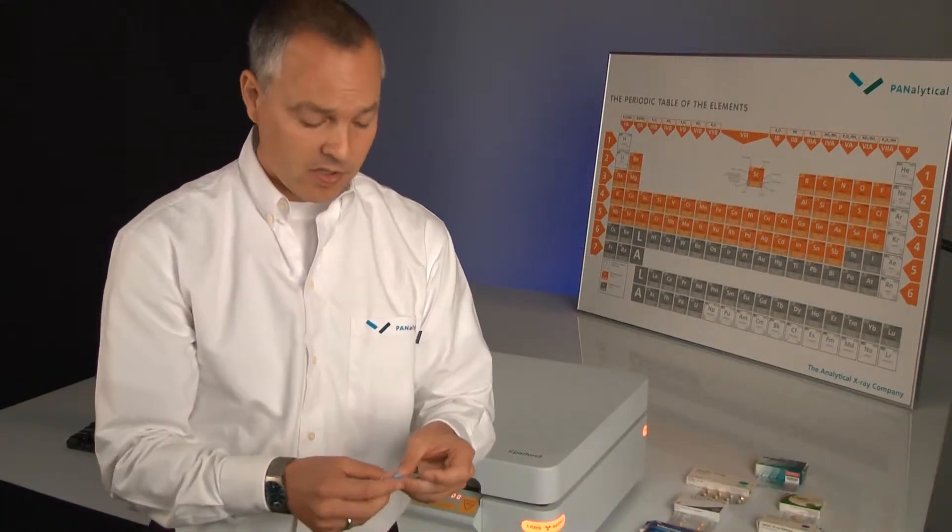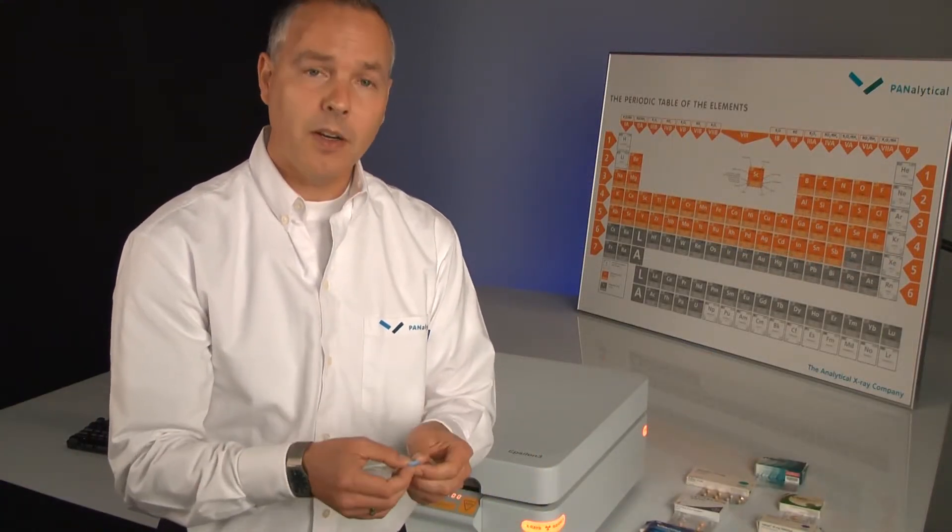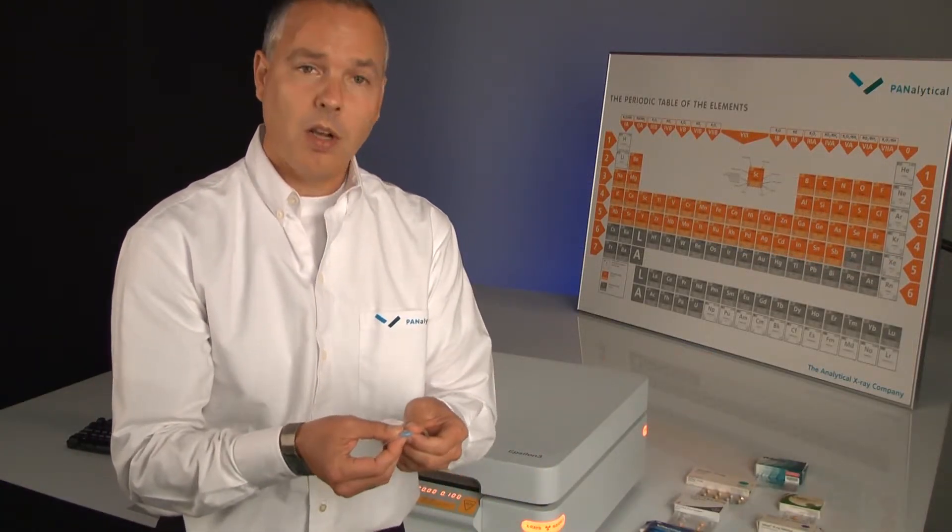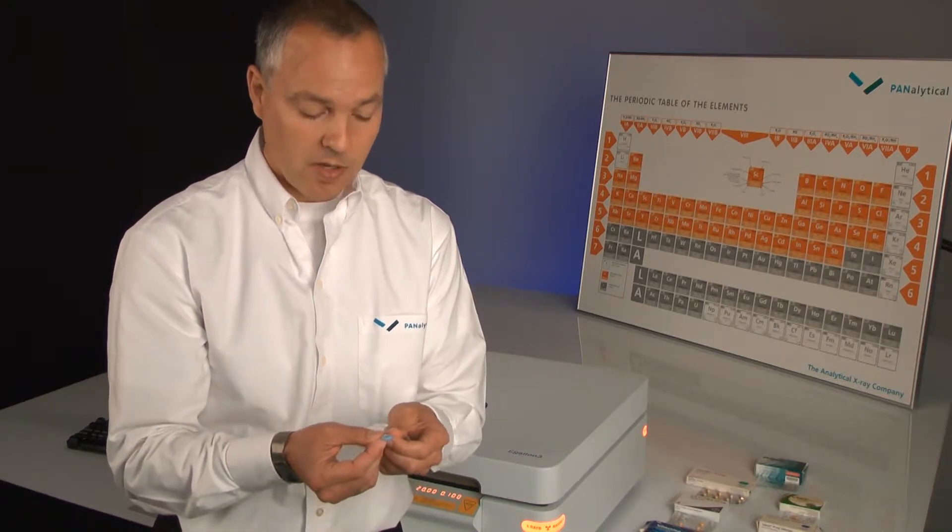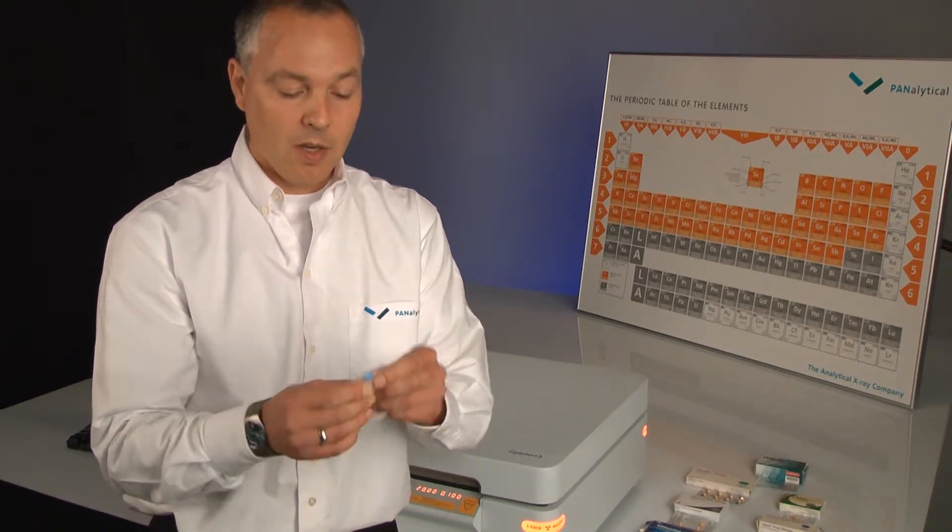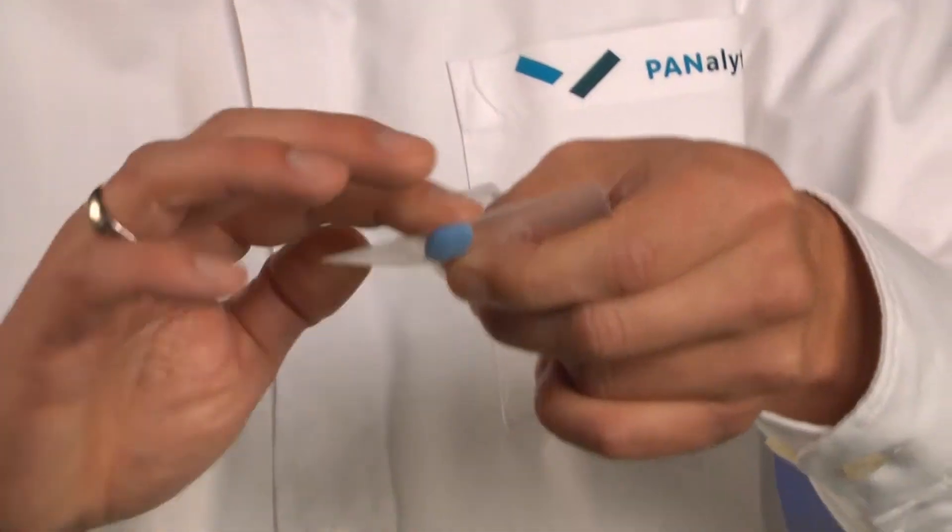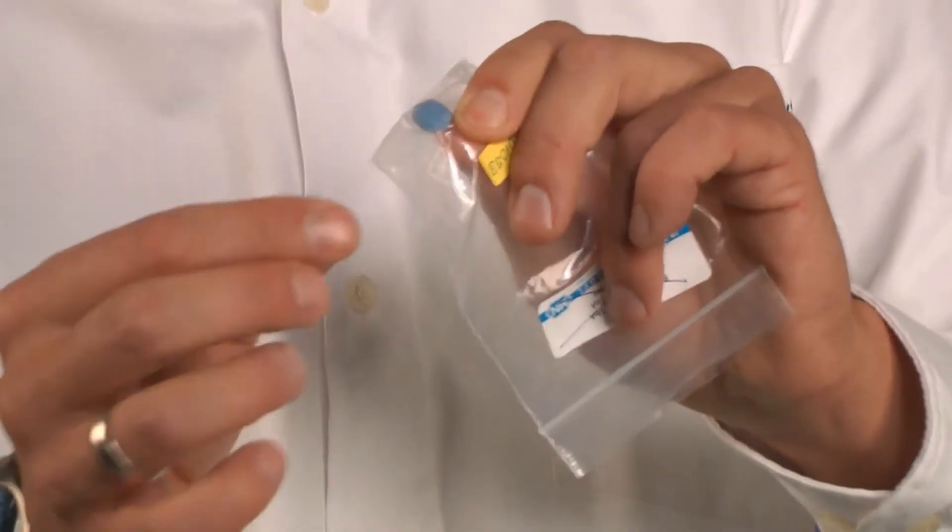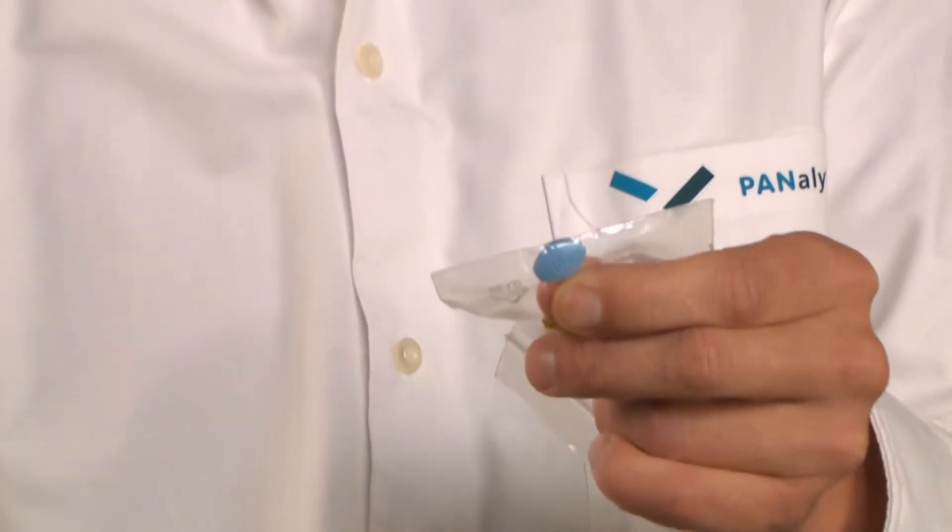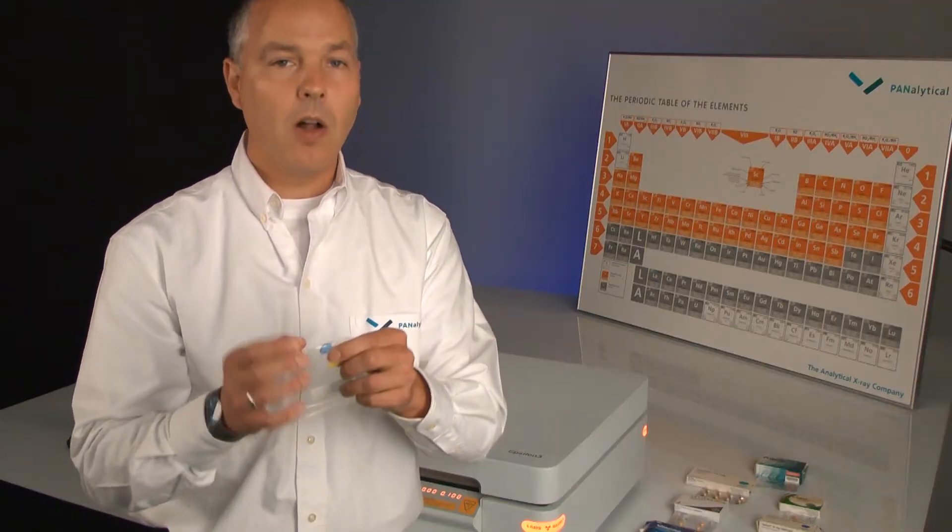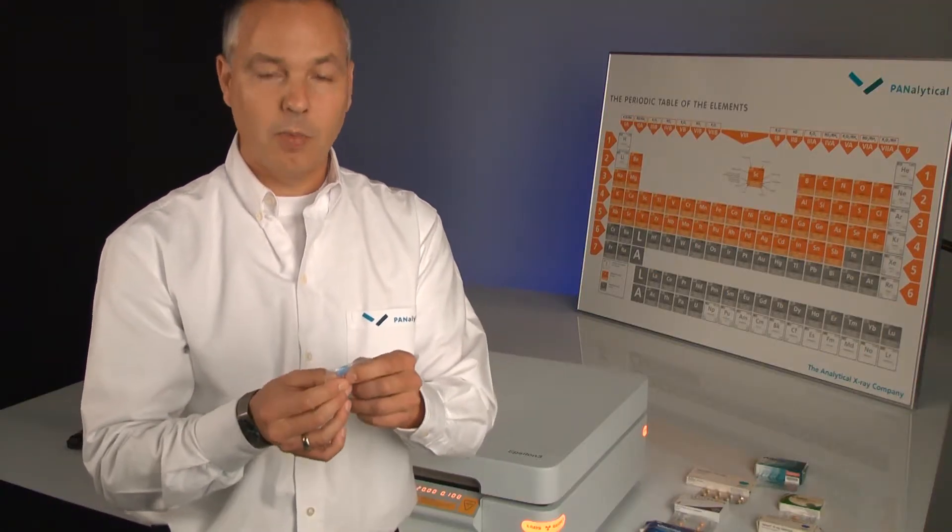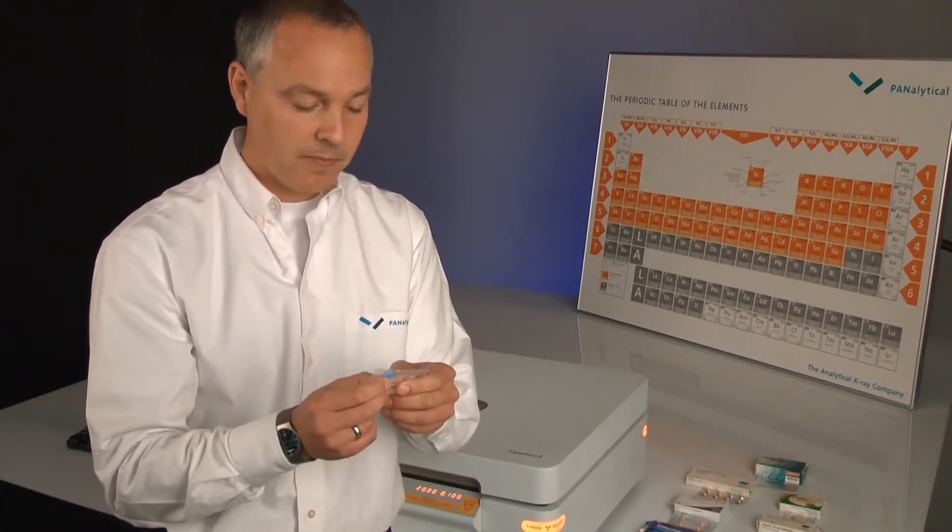The big advantage of the XRF technique is that the entire sample composition and its manufacturing process influence the spectra. From the curvature of the sample to the density, the elemental composition, and even the active ingredient, all are reflected in the XRF spectra.